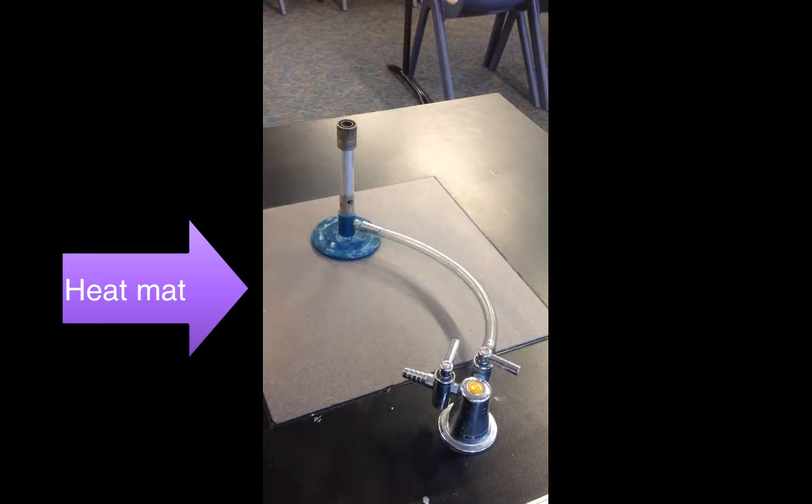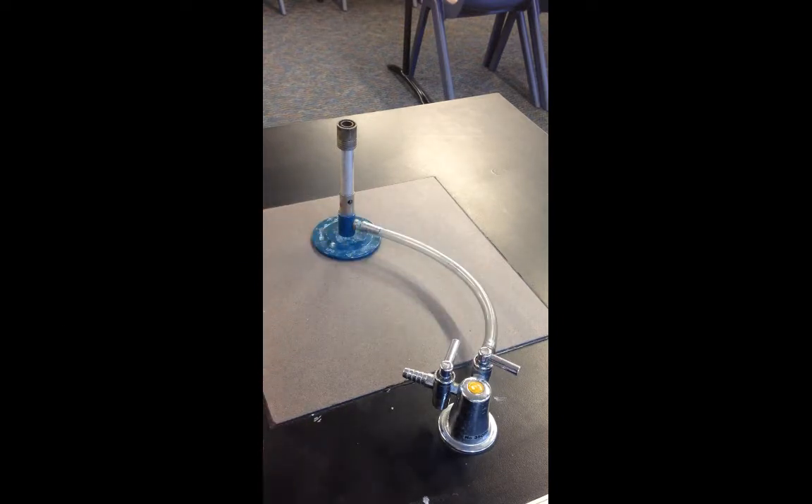To light the Bunsen burner, you start off by making sure that the holes — the air vents — are closed.